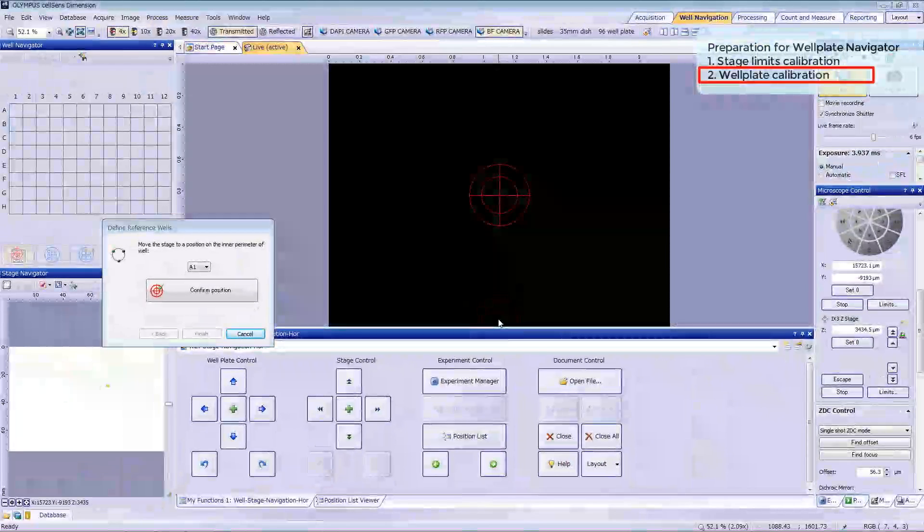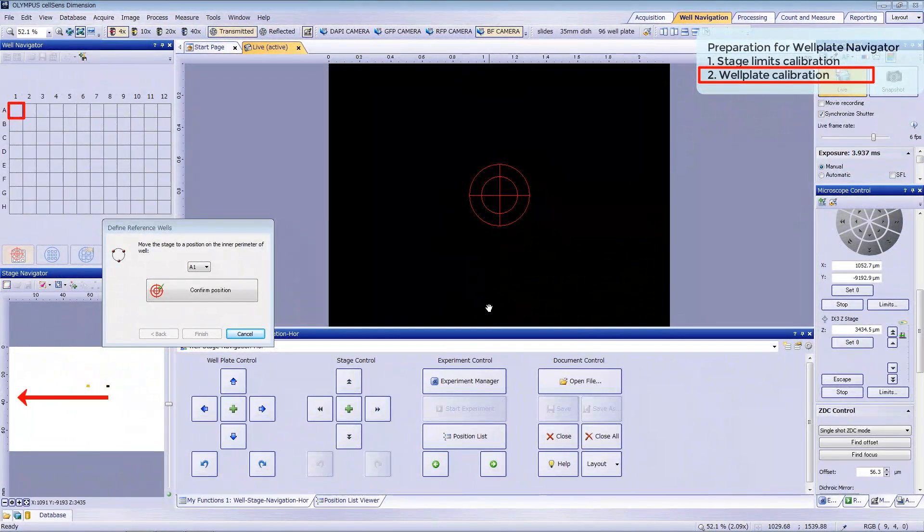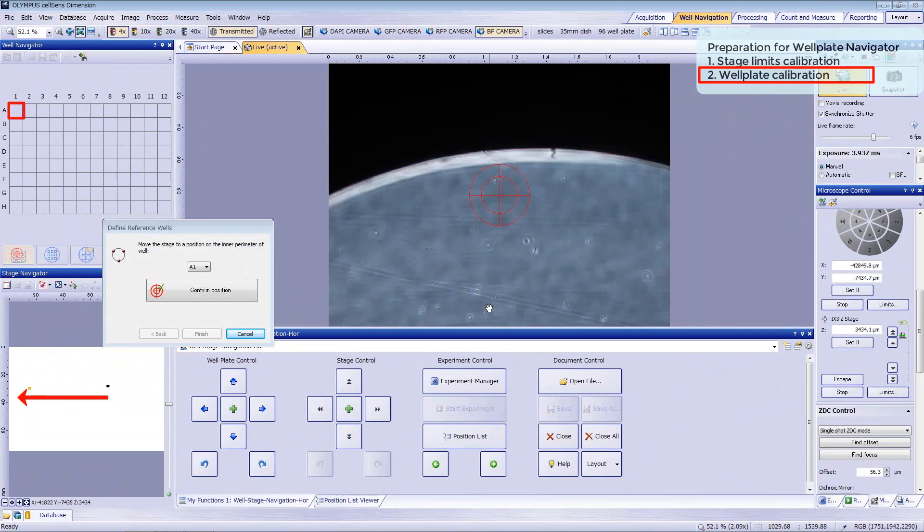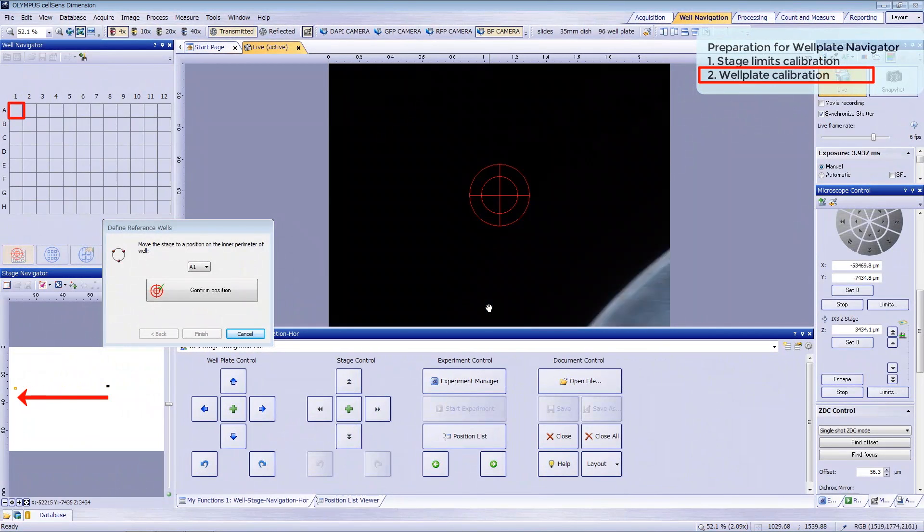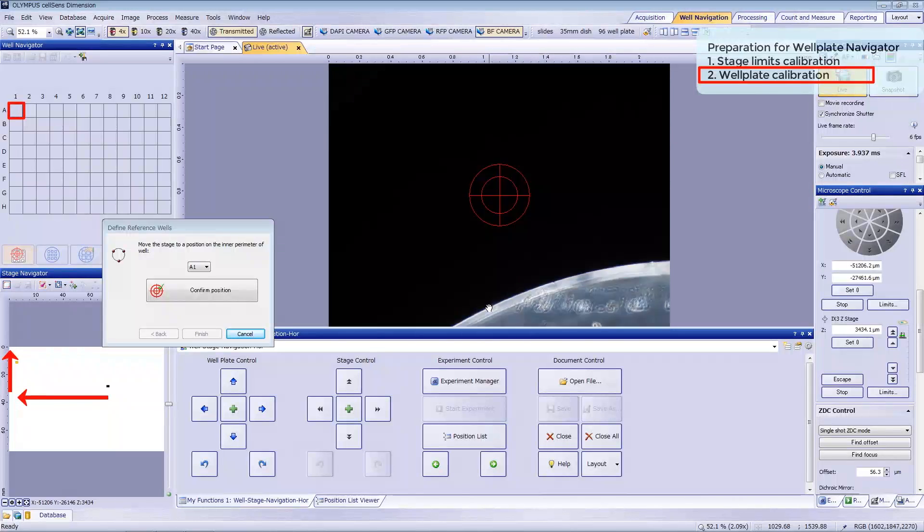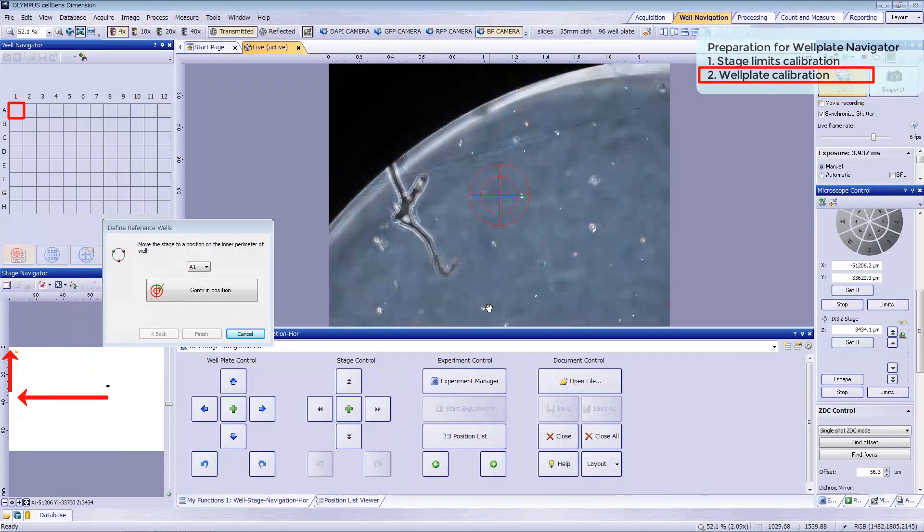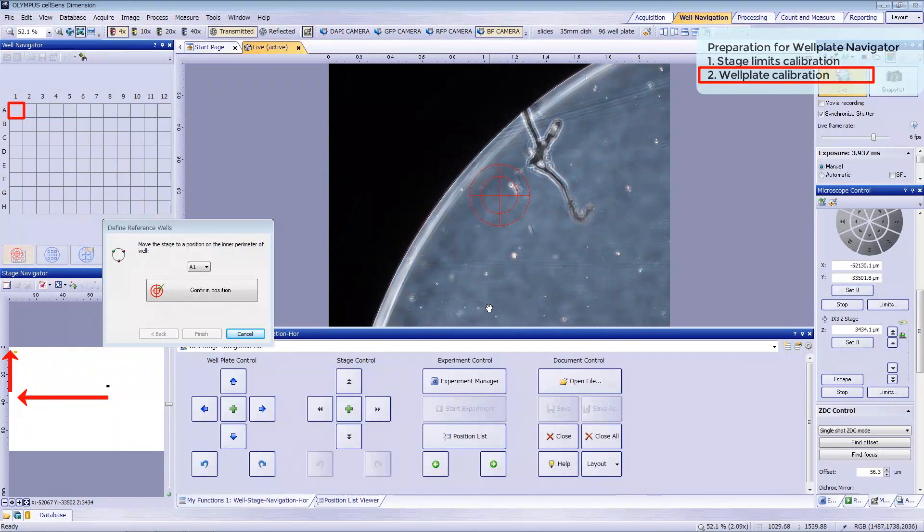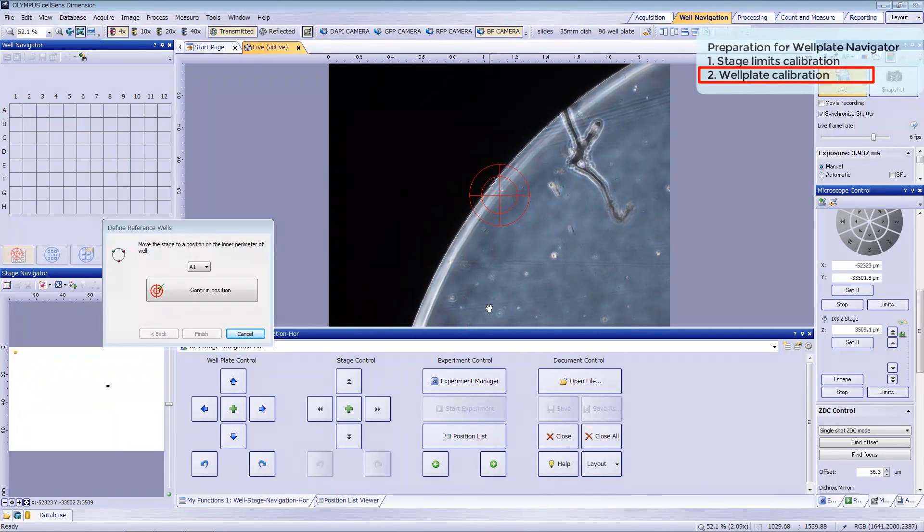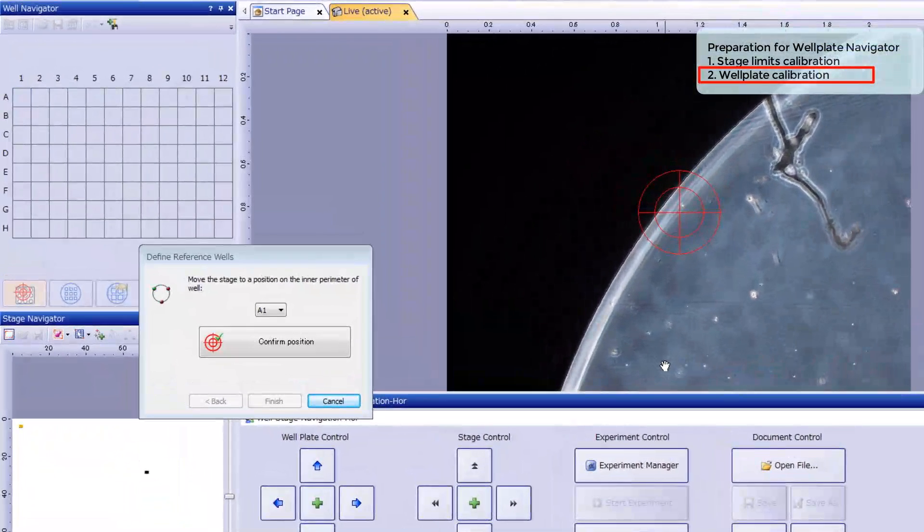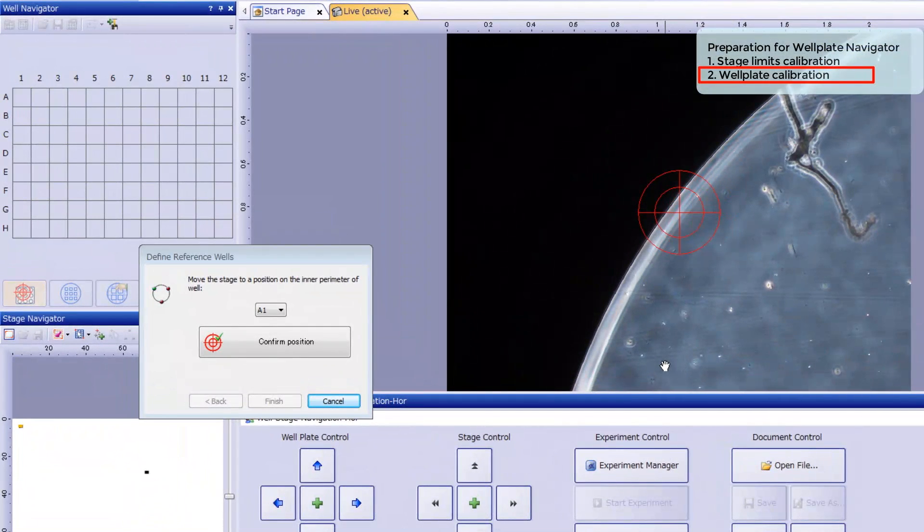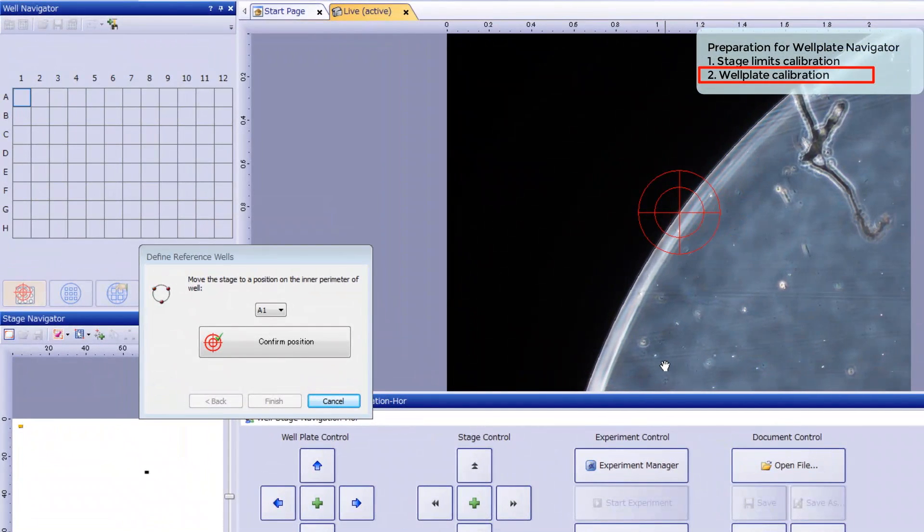The calibration process will begin automatically. We are going to register three points at three wells for calibration. Drive the stage to position A1, which is in the upper left of the wellplate, using the stage handle. Drive the stage to the edge of the well and click Confirm Position.